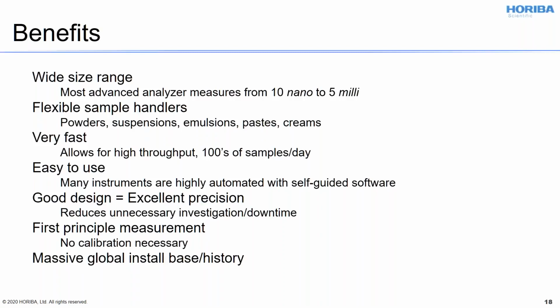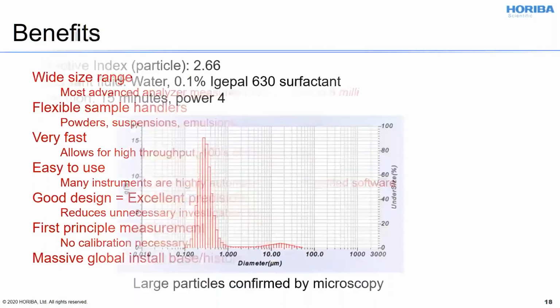And there's a huge install base and history in laser diffraction. It's been such a great technique. It was really started being used before computers could catch up with the theory, but people made it work, and I'm always impressed by that. It means you have a lot of history to draw on, particularly when you look at things like method development.